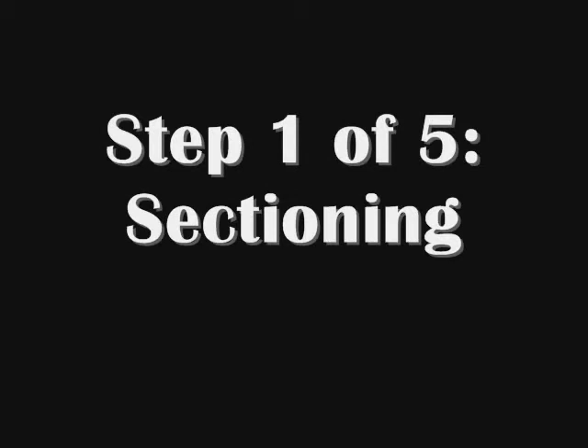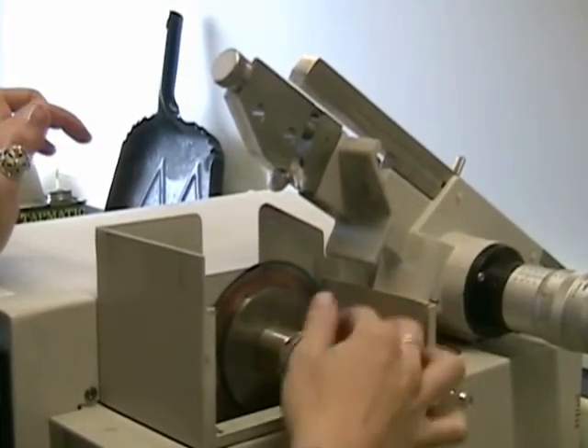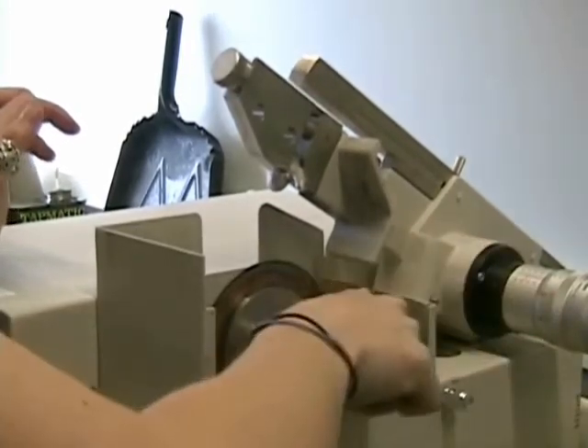The first step of the process is sectioning. The saw used depends on the composition and the size of the sample you have. The diamond cutoff saw is used for small samples that require small precise cuts. The first step is to tighten the blade onto the machine. Note that the safety shields aren't on just for video purposes.